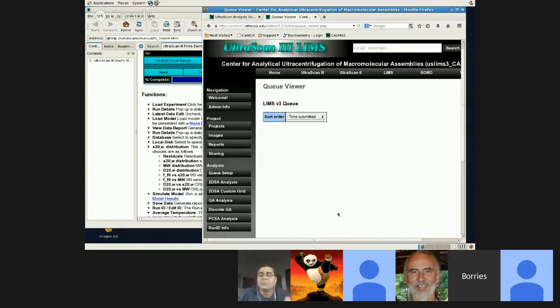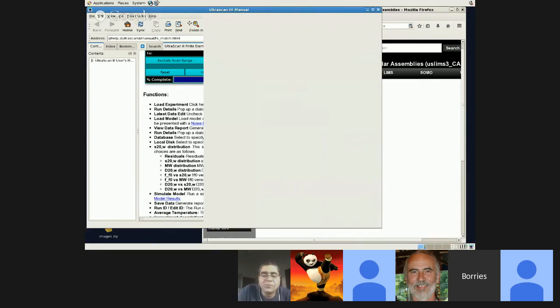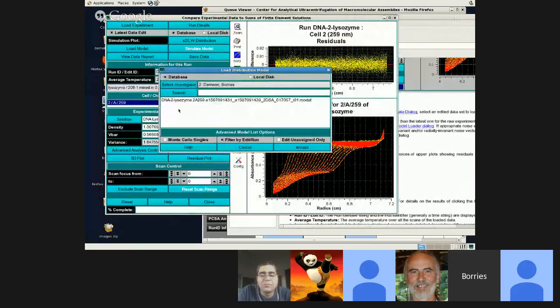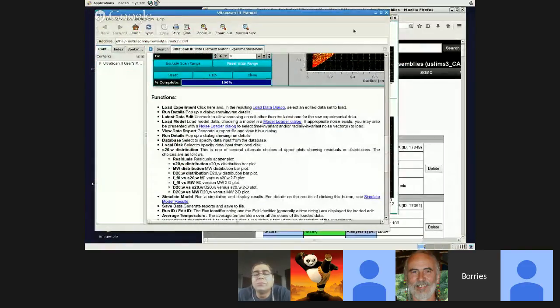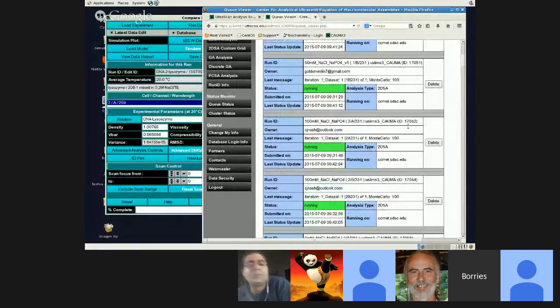What's going on here? We're not getting the queue status back. Well, let's see if our job is finished. I'm going to take a look at it by looking at the models, but no, there are no meniscus fit models back yet. So I'm not sure what the issue is, but now the queue has refreshed here, so let's see where our job is.